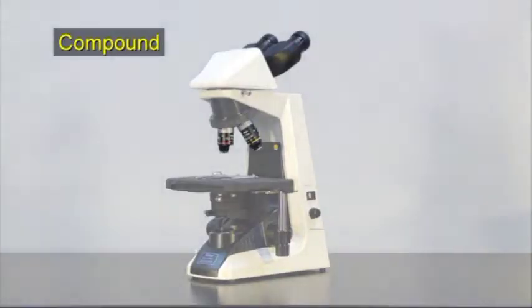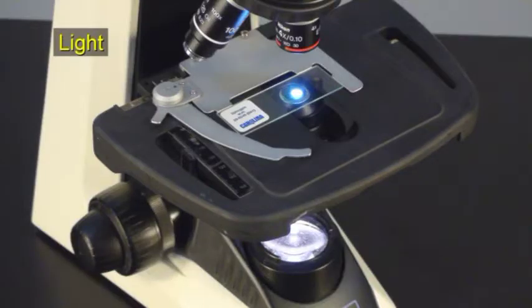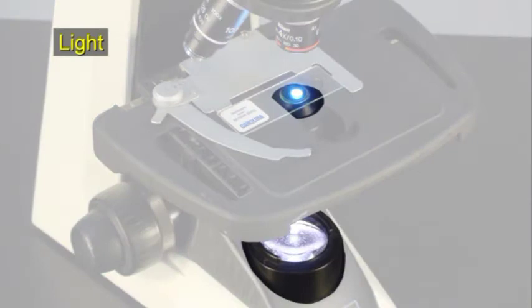Compound indicates that it uses two or more lenses to magnify the specimen. Light refers to the visible light it uses to illuminate the slide. This feature enhances your ability to observe the specimen.